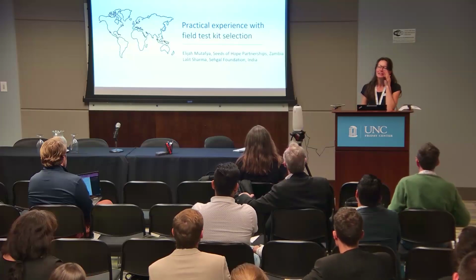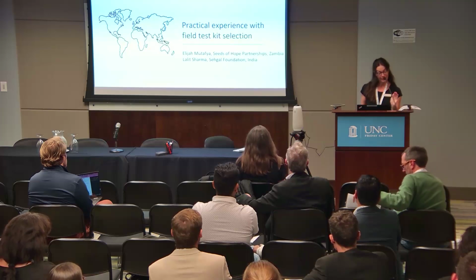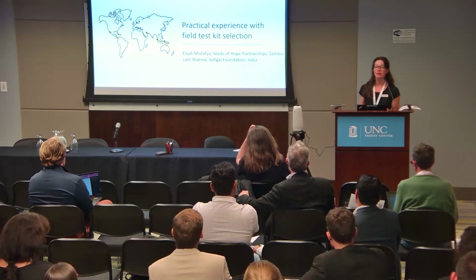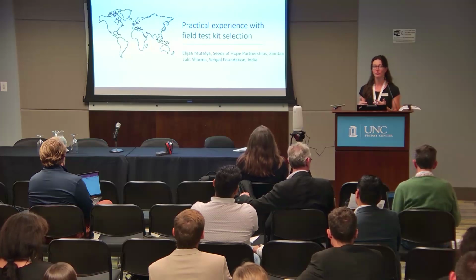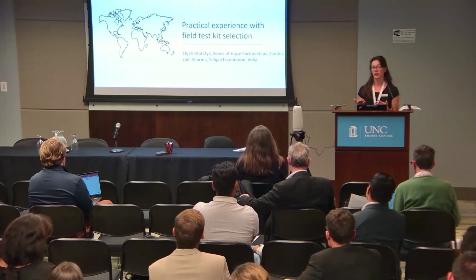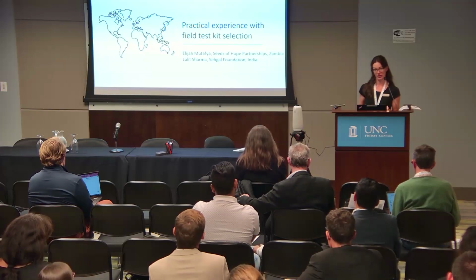Okay, so I mentioned earlier in my presentation, so you won't be listening to me talk for the entire time, we have an annex at the end of the document that has some case studies from practitioners who have selected field water quality testing equipment for their local context and shared why they selected what they selected and their experiences with it.